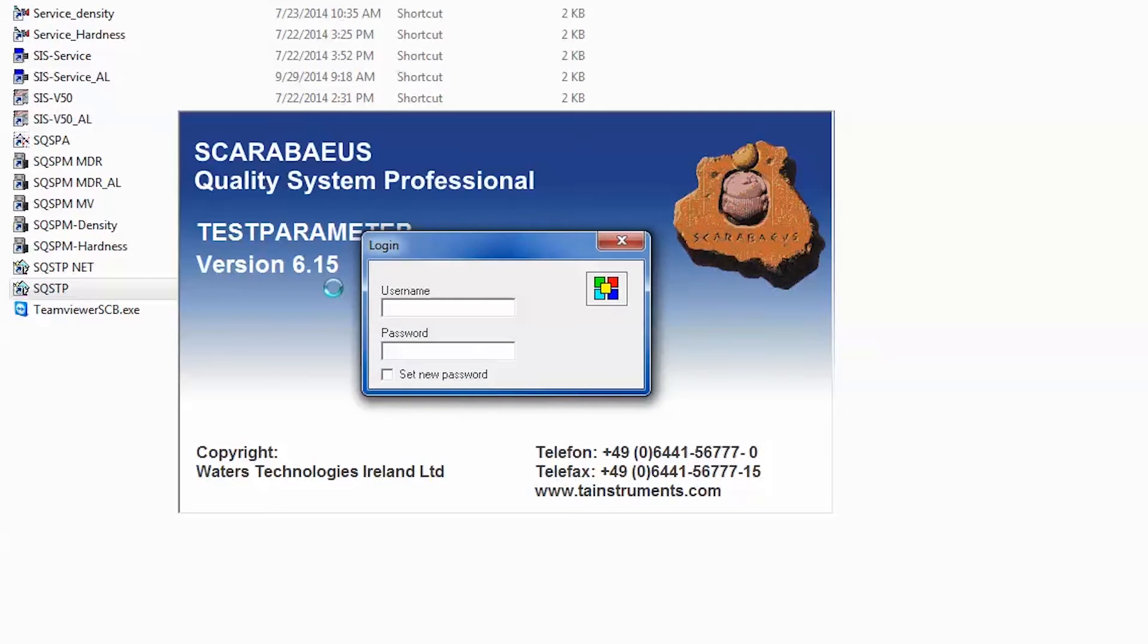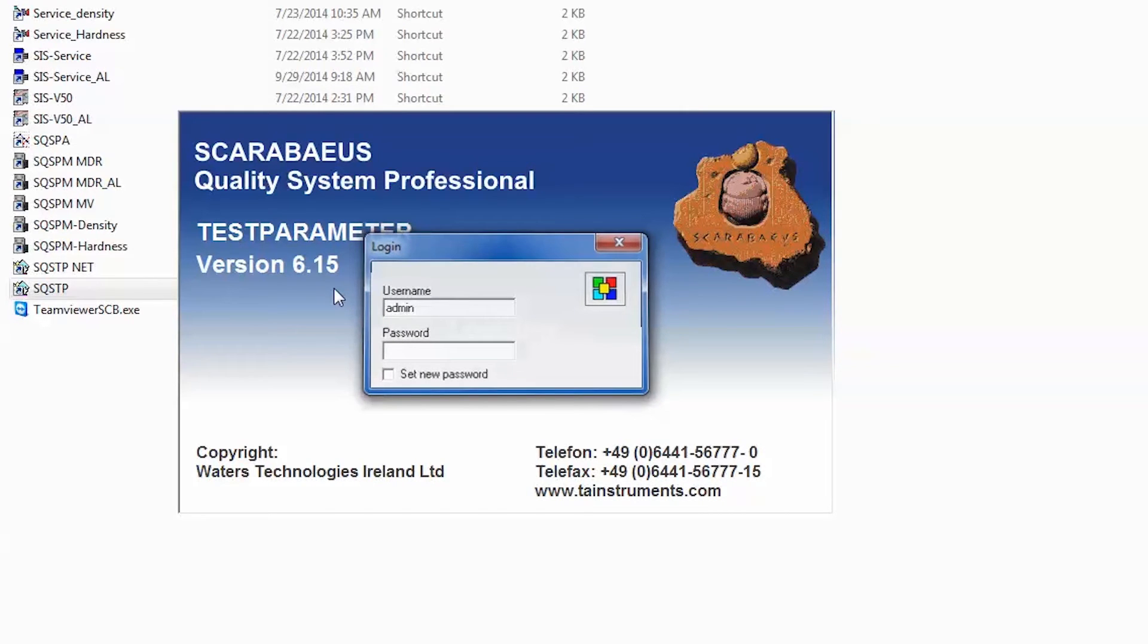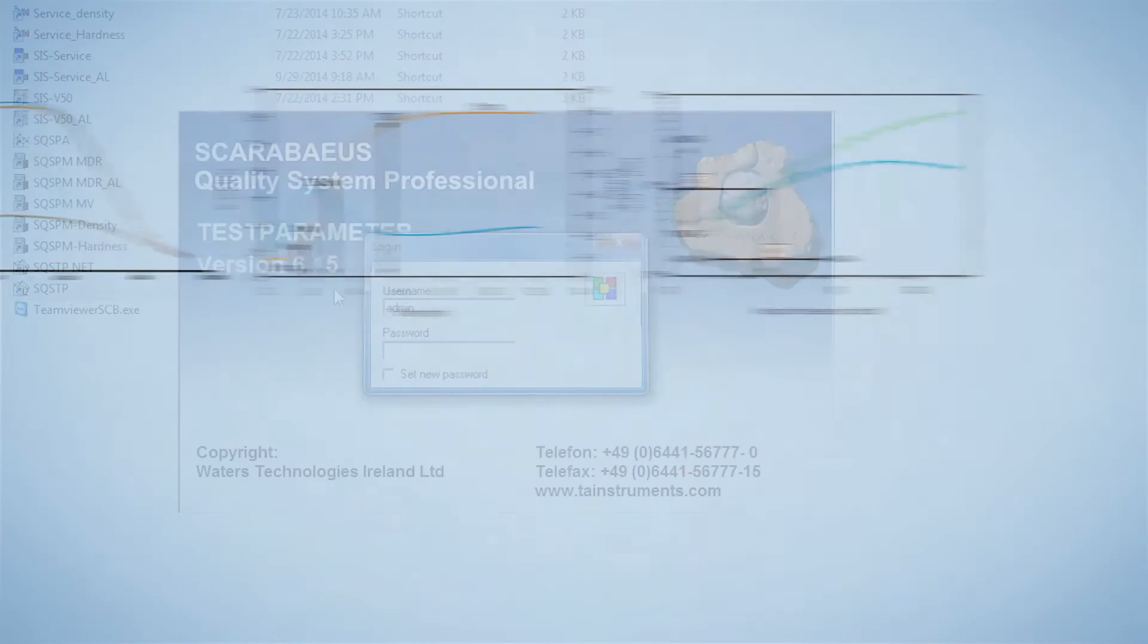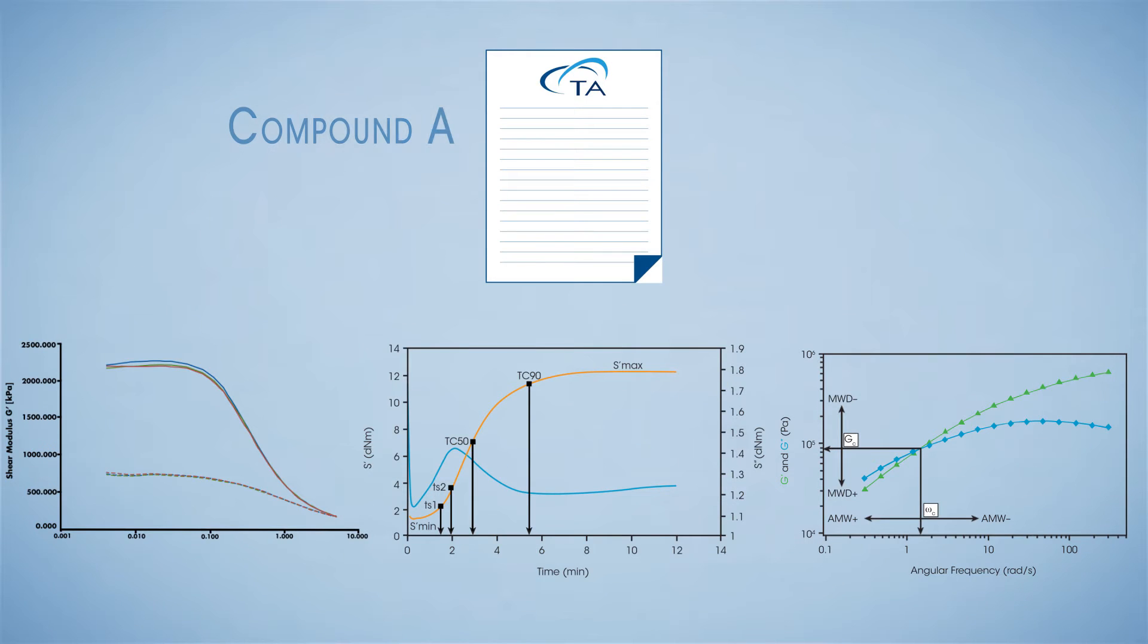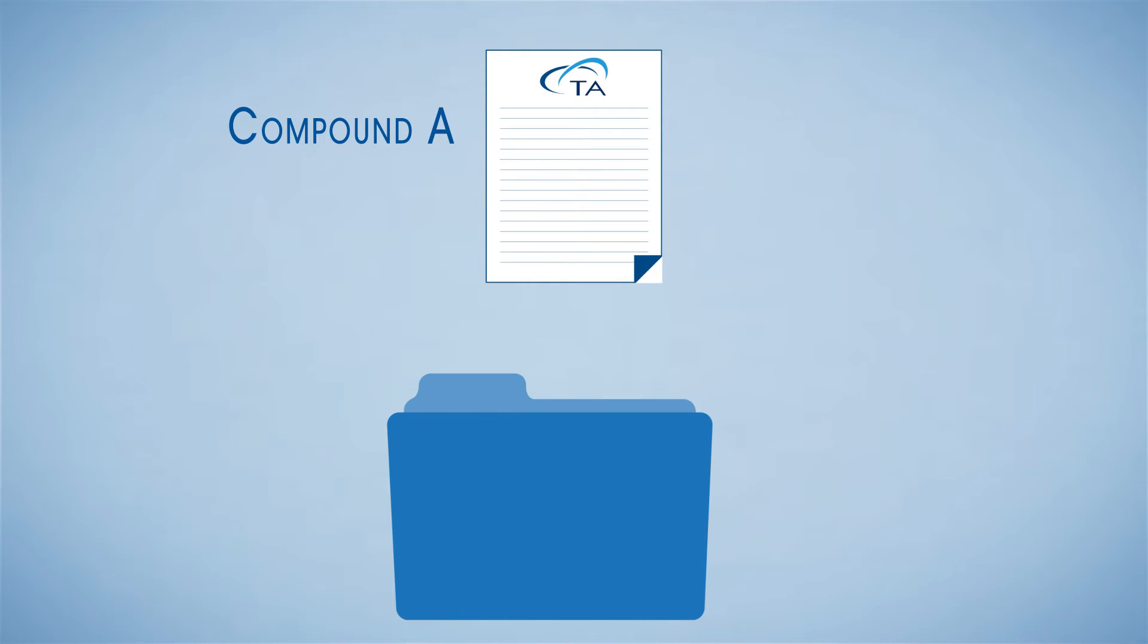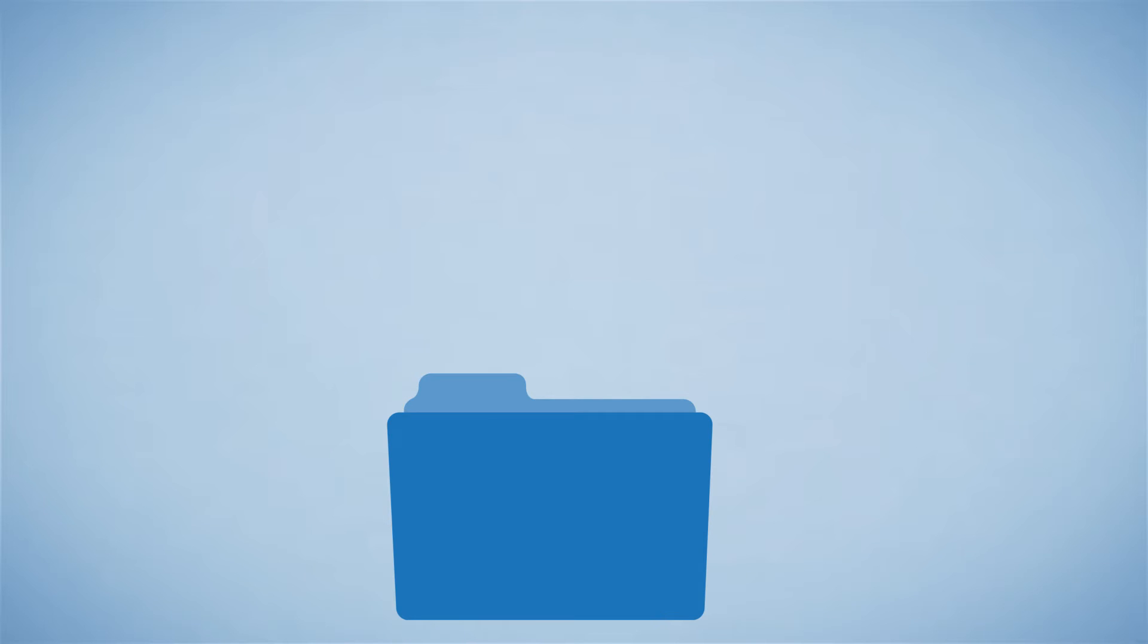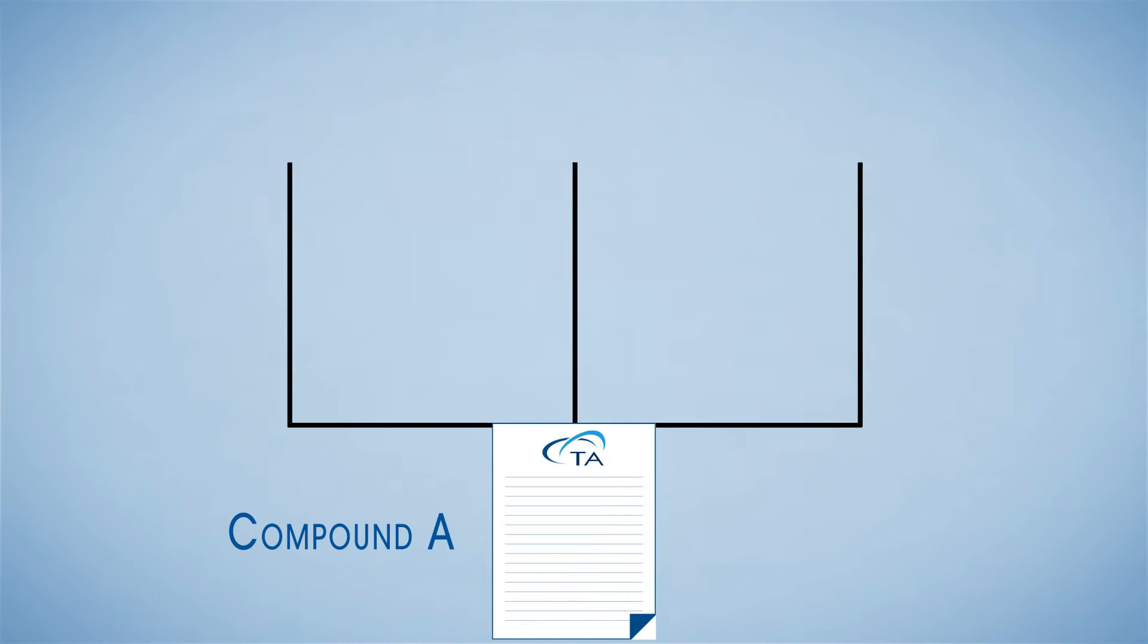Open the test parameter software and log in with your username and password. All rubber test plans are organized by compound names and all of the testing information is saved to a database. Each compound can have one test plan per instrument.